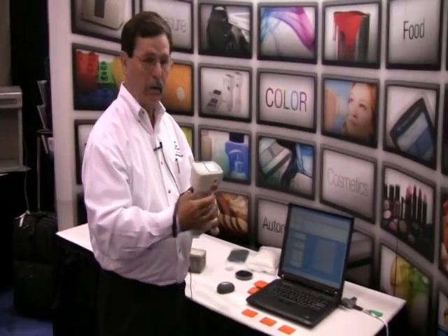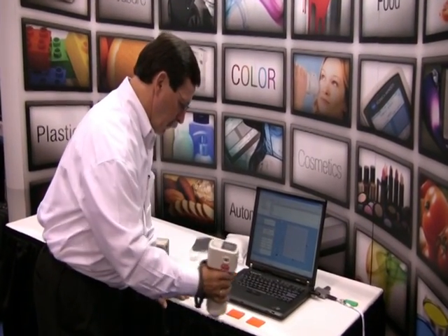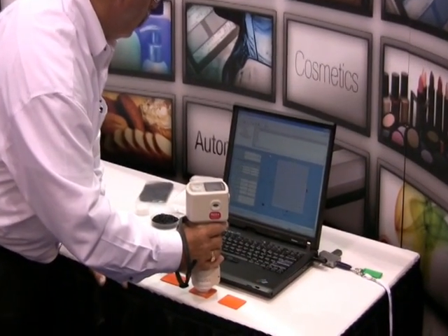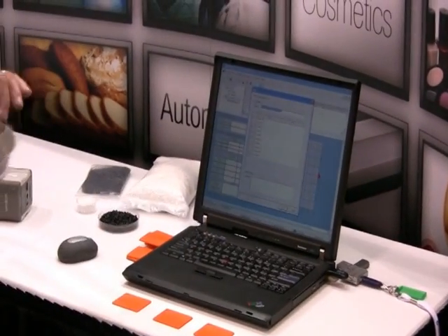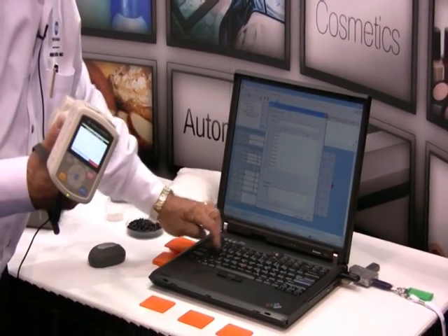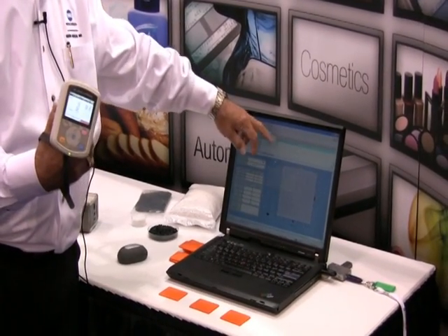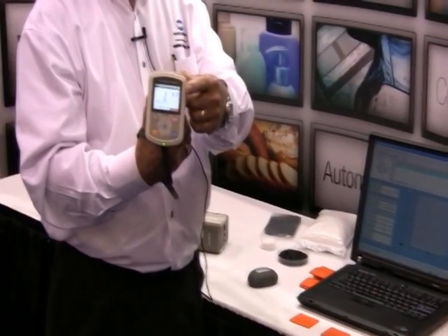First I'm going to measure a target color. So now I've made the measurement. I now have to give the target a name. Now I have my LAB values here on the screen as well as here on the display.